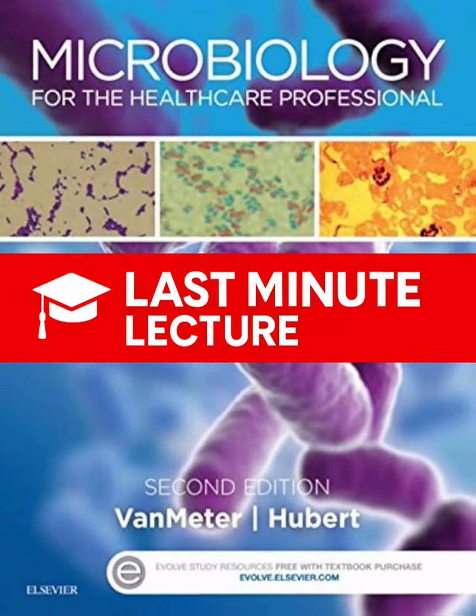Okay, that paints a picture. So that strictness sets the stage for actually controlling the microbes. You mentioned 3 main levels: sterilization, disinfection. Right, 3 key terms people often mix up. The difference is all about what you're killing. The absolute highest level is sterilization. This means destroying or removing everything, all microorganisms, and that includes the really tough ones like bacterial endospores, viruses, fungi, even prions. Total kill. And the workhorse for that in the lab is the autoclave.